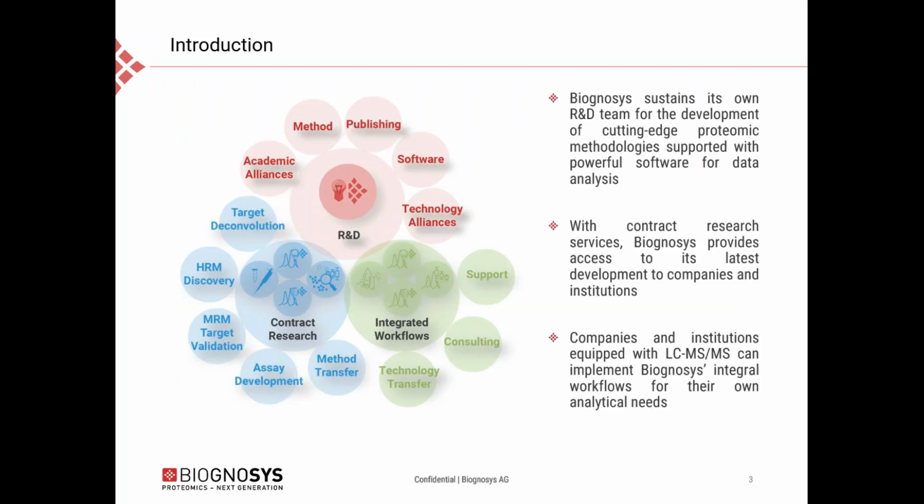The software tool QuiC presented today is a prime example of how Biognosys actually works in its core between the R&D department, the contract research department, and the integrated workflows or the product department. QuiC was initially discussed with some of our product customers who said that they're lacking some good quality control software, and we then went back to our R&D department and asked Lukas and his team if they can actually develop such a tool.